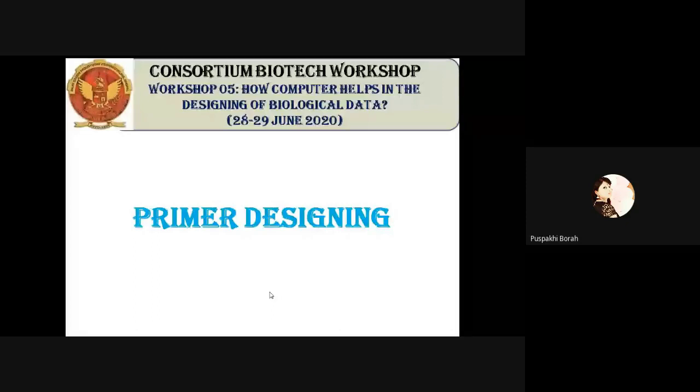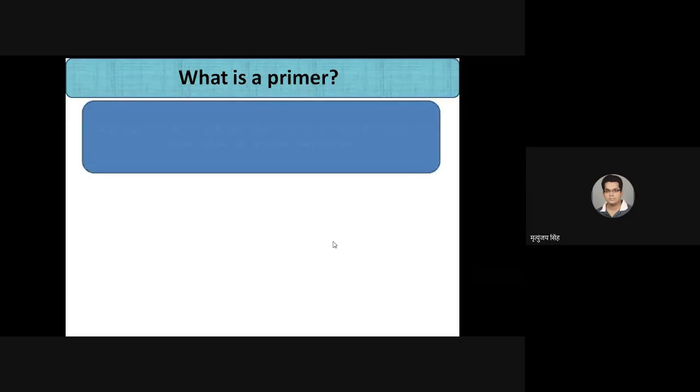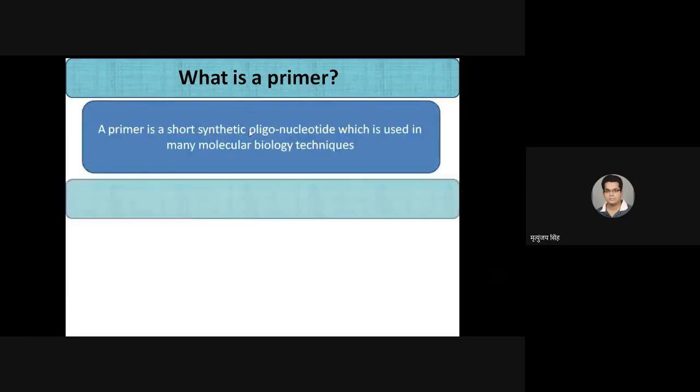Now we understand primers through some questions, like what is a primer? A primer is a short synthetic oligonucleotide which is used in many molecular biology techniques. Then, why do we need primers?